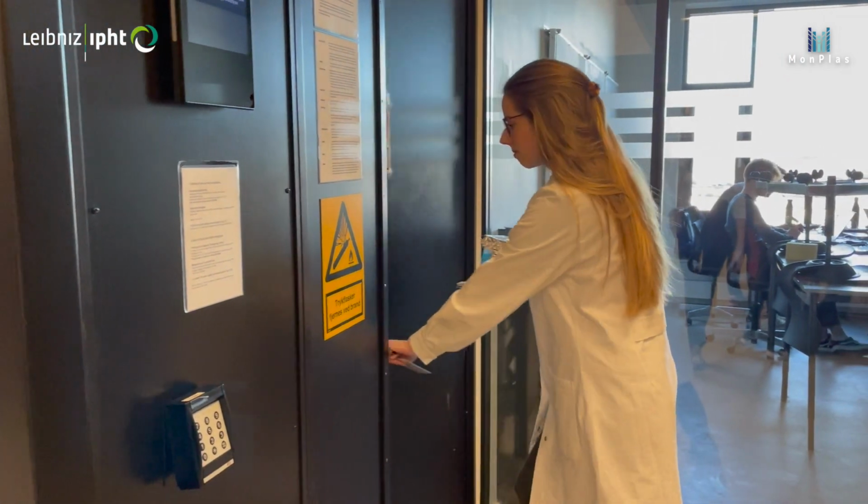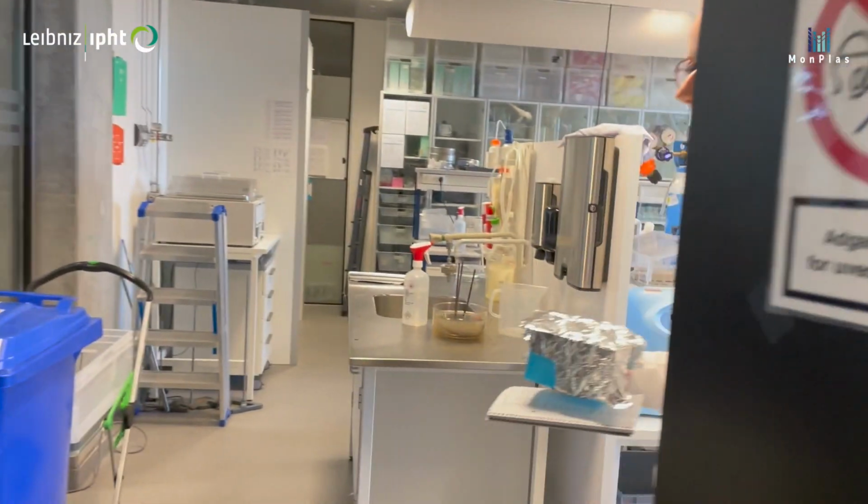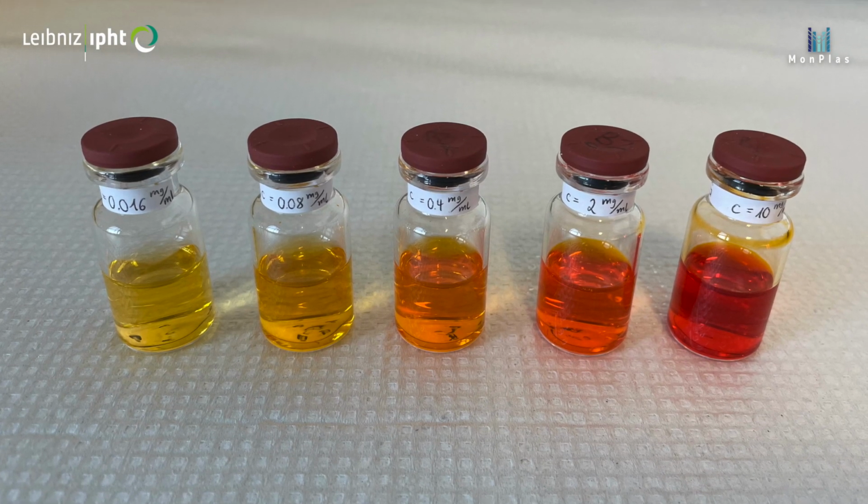These past few months I spent in Denmark at Aalborg University for a research collaboration. I stained microplastic particles there and developed a reproducible routine that worked for our labs here in Germany as well as for the labs there in Denmark. Now I work on well-defined microplastic references and developed image processing methods for it.